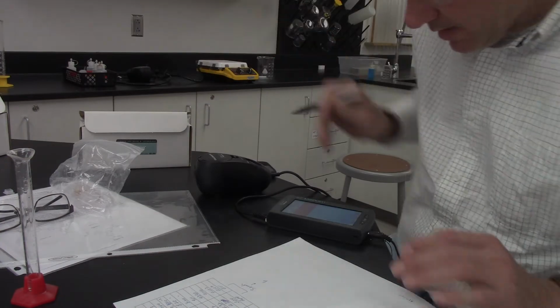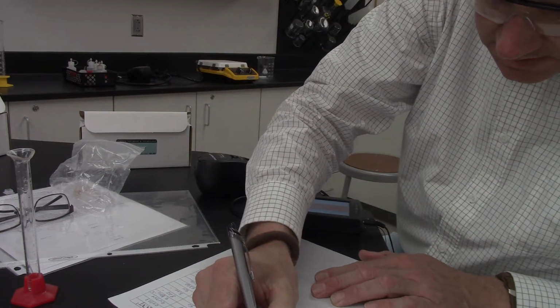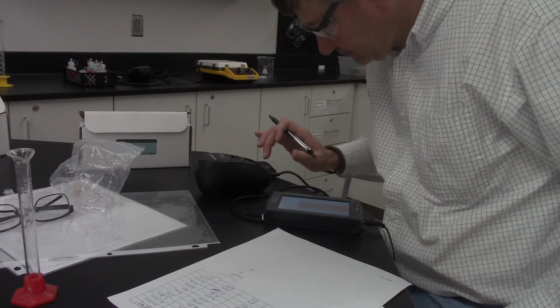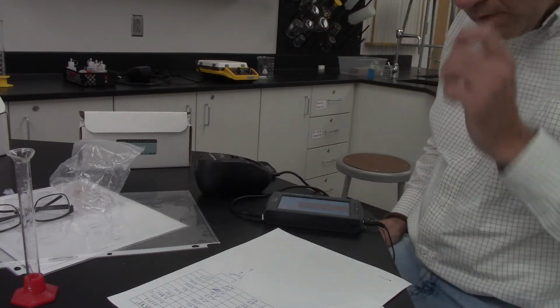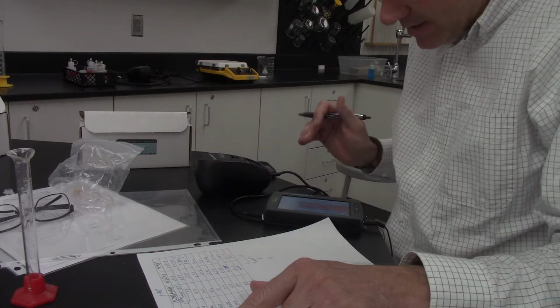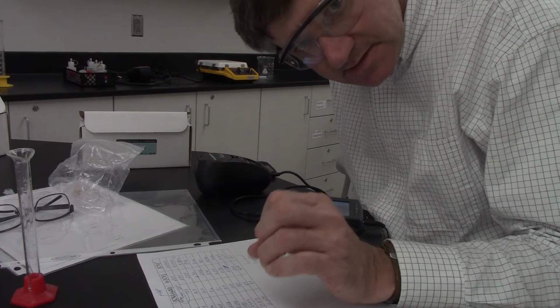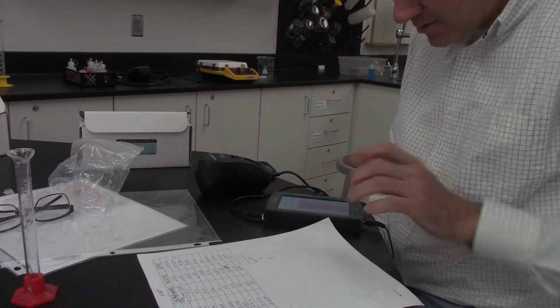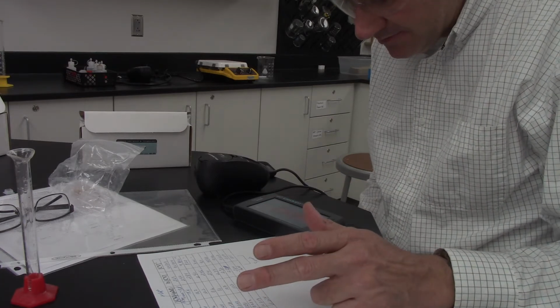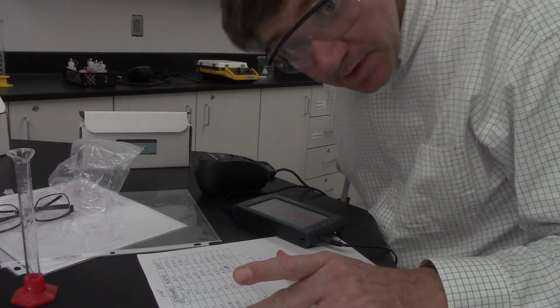we were recording an absorbance of 0.770. So every 30 seconds after that, we're going to record our absorbance. What should happen is that our absorbance should go down as the crystal violet is being used up. We started at 0.770, and we've already dropped to 0.75. This is going to get really boring, by the way.